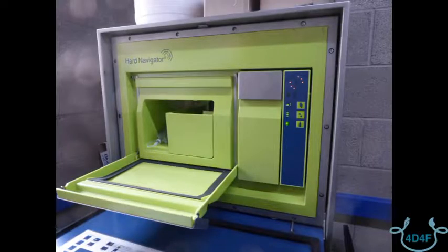The navigator itself is a tool which takes a sample of milk and analyzes that milk for various components.